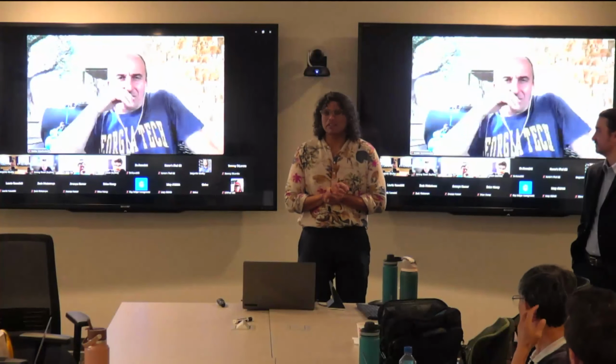So we're going to quickly walk through the different studies that we're going to talk about and how those different factors are going to be relevant in just a second. So first, we're going to go through the development of a novel flow imaging microscopy instrument, that's ARTiMiS, how we developed it and then evaluated it. Then we're going to talk about an extended sampling campaign that we used ARTiMiS to study a wastewater treatment system. And finally, we're going to look at a novel methodology using deep learning to get new insights through cell phenotyping.